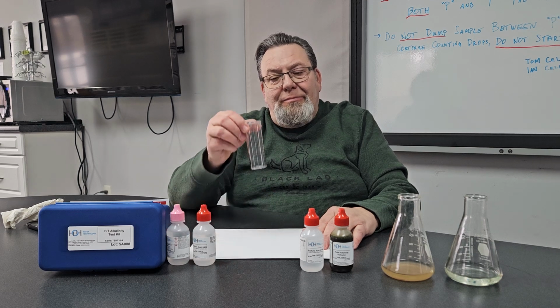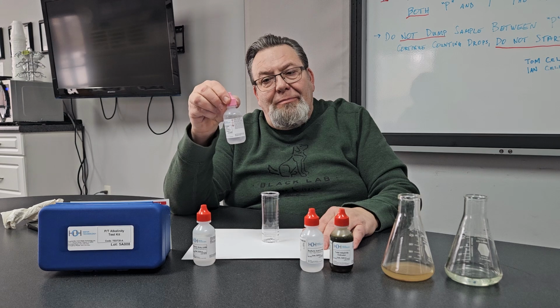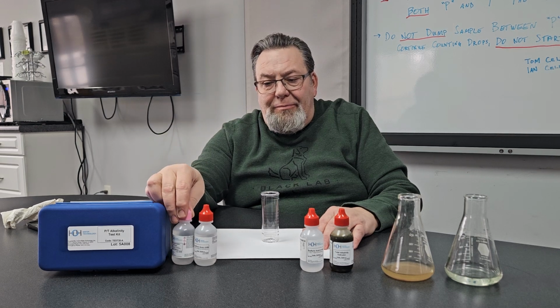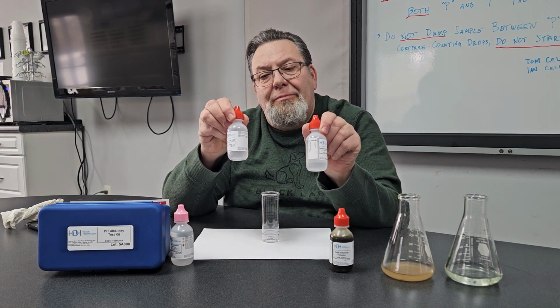You also have the same clear test vial that's in every other test kit you use. To your samples, you're going to add phenolphthalein indicator. This will turn your sample from clear to pink. You will titrate your sample using sulfuric acid. In the kit, there are two separate ranges.